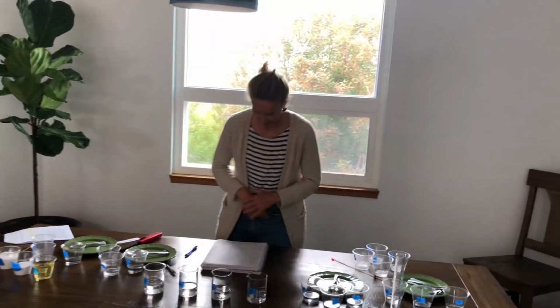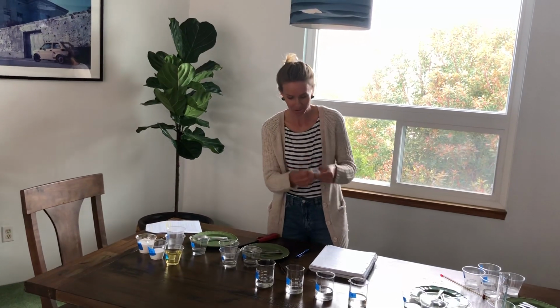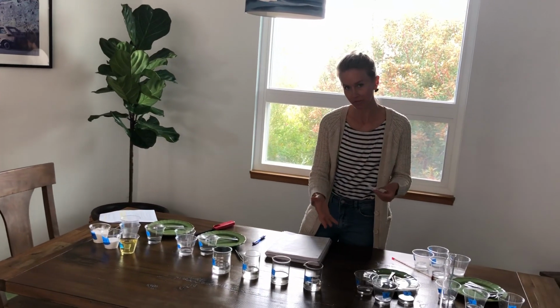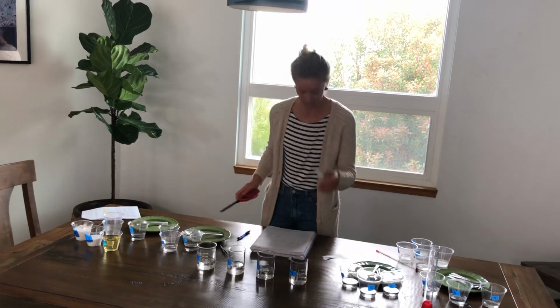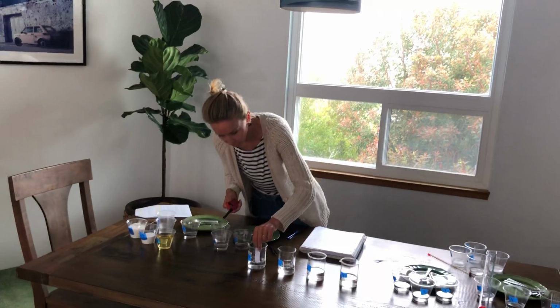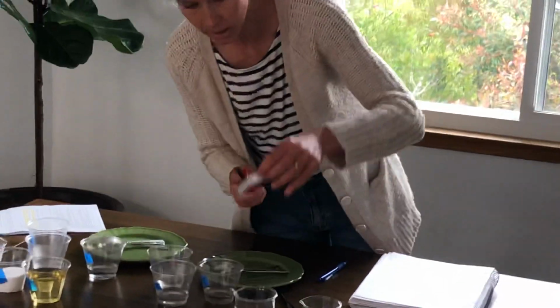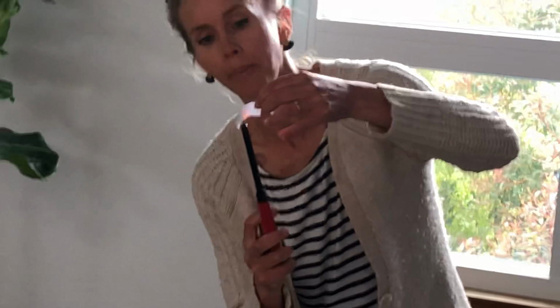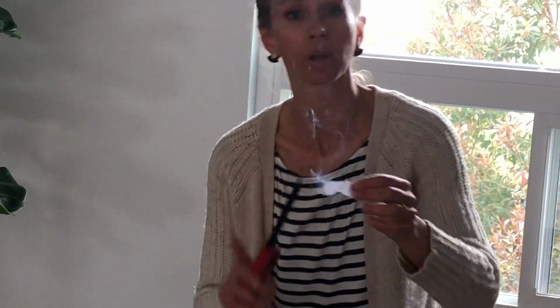Let's do a fun one. Let's do flammability. Let's see which of these will burn. So I'm gonna dip this paper strip into each of the mystery liquids and see if they burn or not. Don't try this at home, please. Liquid number 1. Liquid number 1 here, is it flammable? Liquid number 1, no.